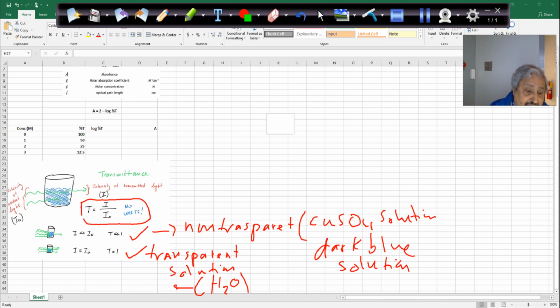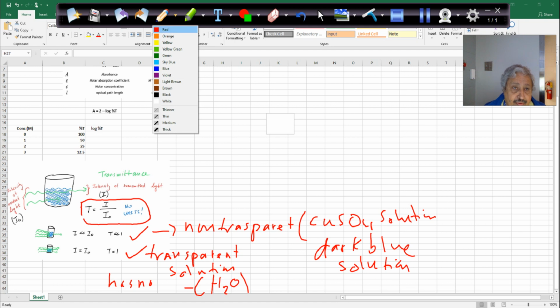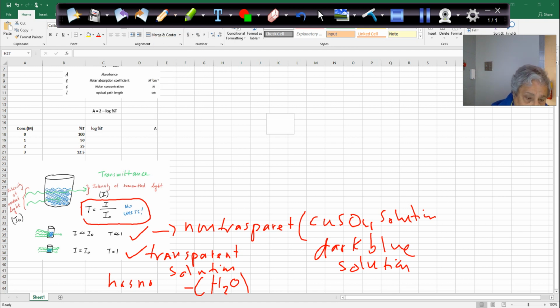H2O has no color, no color. Let me just write it here: has no color. That's the transmittance. You have to know that; it's not in the procedure, which does not show you all the details.